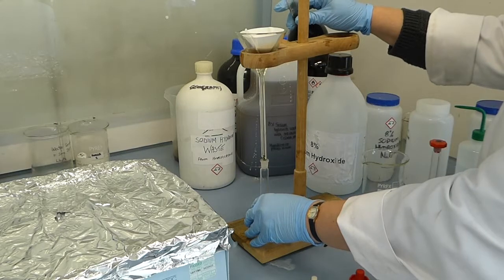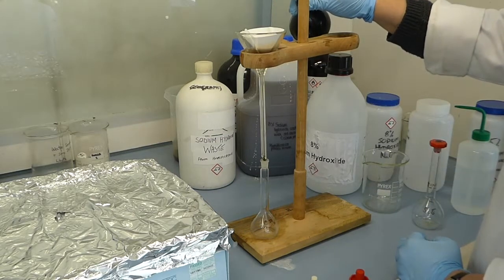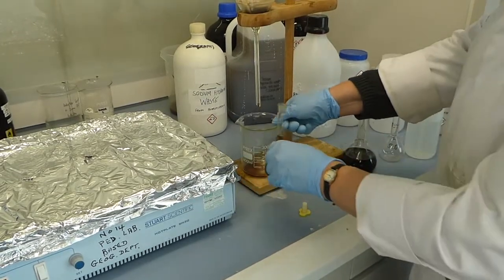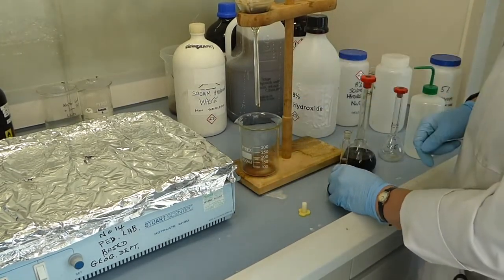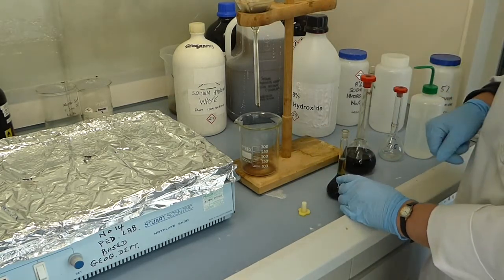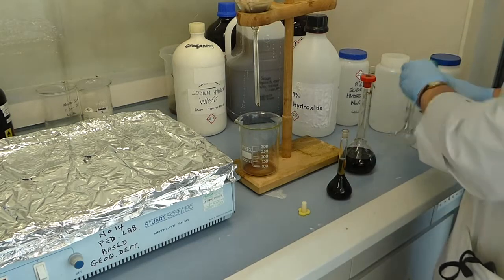Again, make sure that you've got the funnel aligned. You don't want it sitting in the flask, but sitting just above. You need to be careful that you stop at 50 ml. If you've still got excess solution in the funnel, just put a beaker underneath and catch the rest.